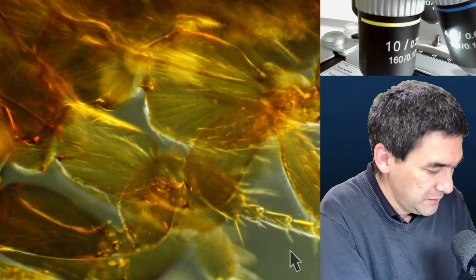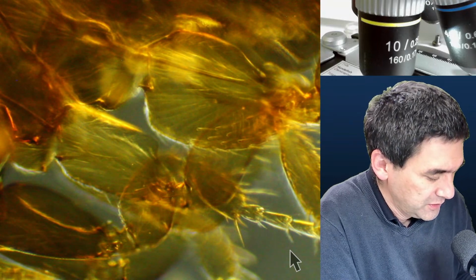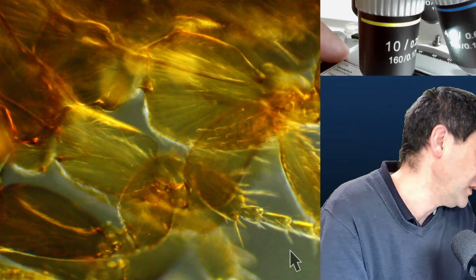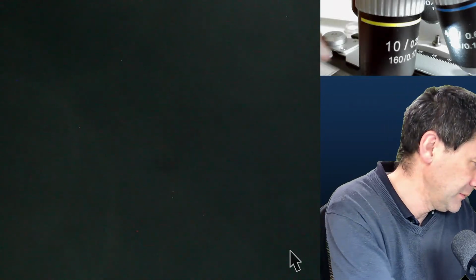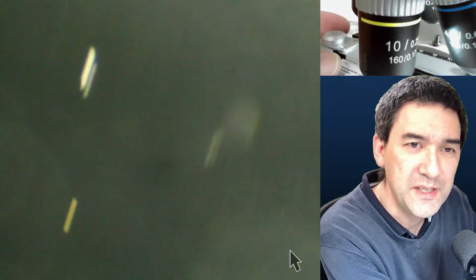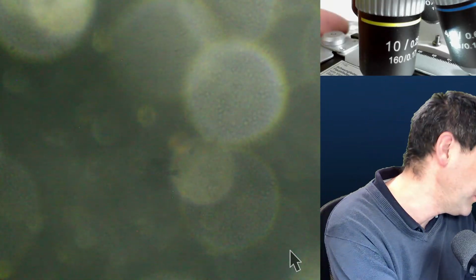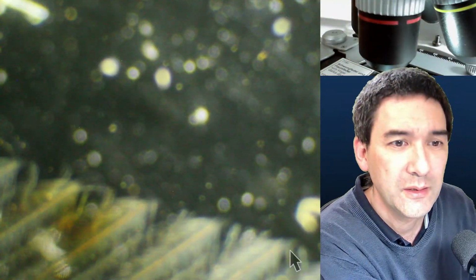So, okay, let me show you a couple of other specimens here. What is this one here? Ah, that's a bird's feather. Gallus domesticus. That's actually a chicken feather, right? So let's have a look at the feather. Again, I pre-selected those specimens which basically give you a fairly good effect, but I always have to find them. I'm not sitting behind my microscope, I'm just looking at the computer screen. And here we go. Oh, this is pretty dirty, this one.